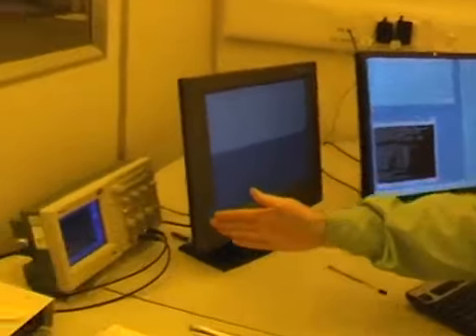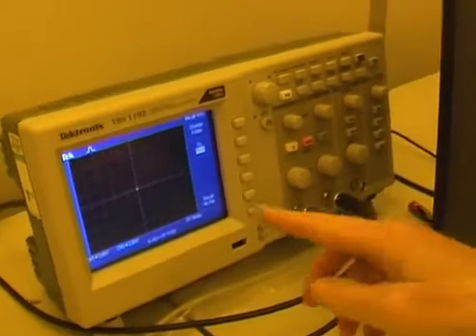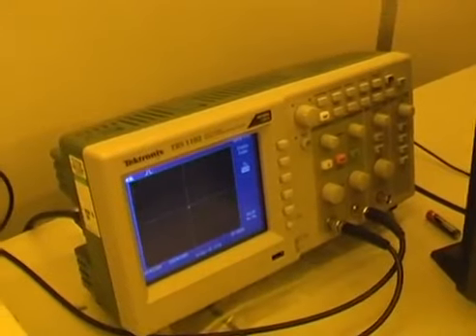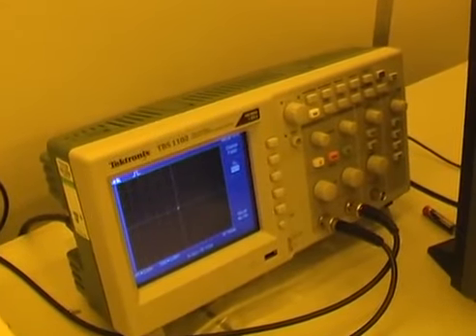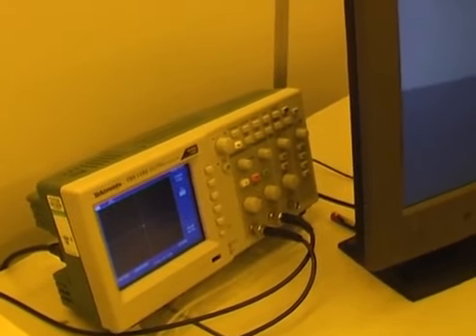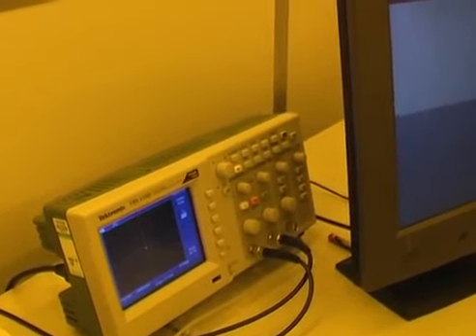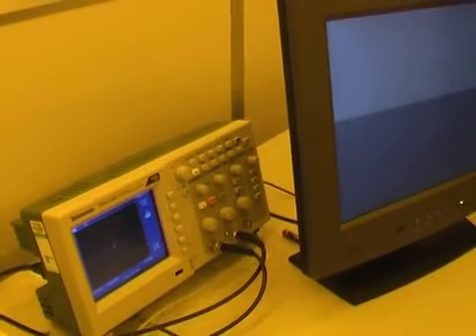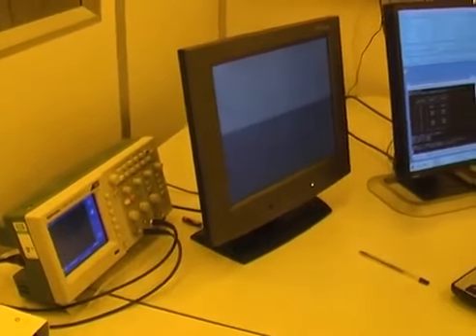And then finally, we have this oscilloscope, which is in XY mode and simply has a spot which tells us the position of the main field deflection. And at the moment, the main field is doing nothing. When it's exposing a pattern, you will see this exposing the shape of your pattern. When it's doing calibrations, you'll see it dancing around doing calibrations. So as a diagnostic tool, it's quite useful.